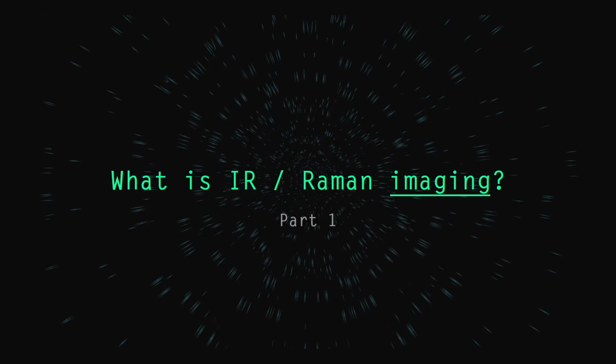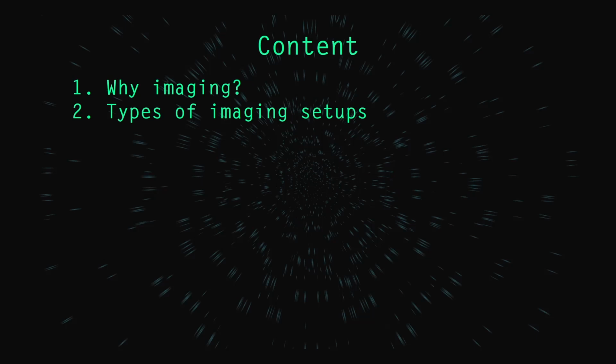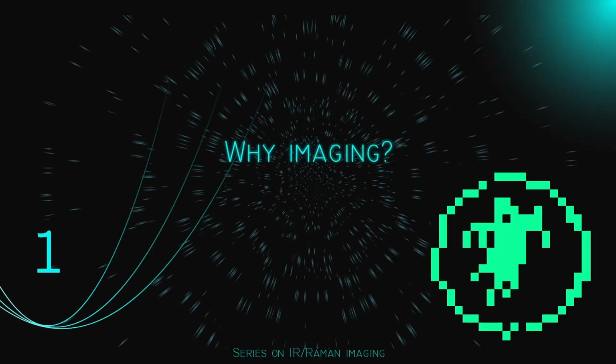Today I'm talking about what is infrared and Raman imaging. This video is part of a series giving you an introduction to imaging by infrared and Raman spectroscopy. In this video I will cover two topics. First, the motivation to perform imaging experiments, and second, types of imaging setups. Let's start first with why imaging at all.